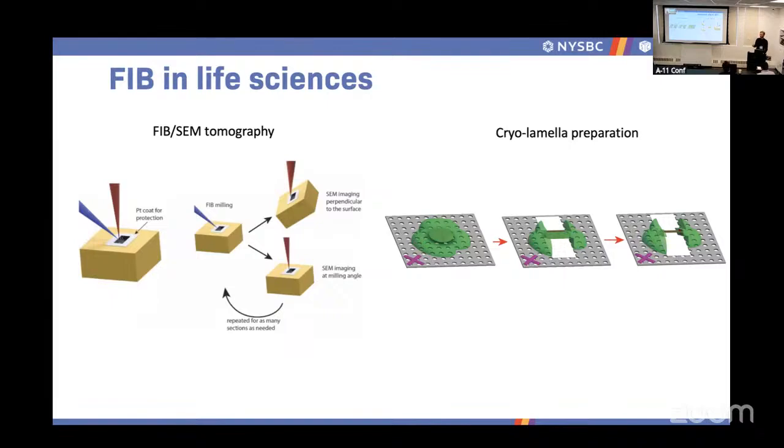In material science or in semiconductors, you can use it to build structures. You can dig holes so that you can make surfaces. There's a ton of stuff. There's some guy in Spain that made springs, which were tiny springs. But you can make all this stuff. I think Theo, you come from that lab.